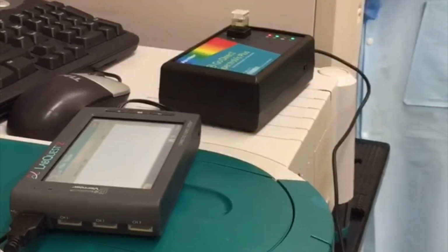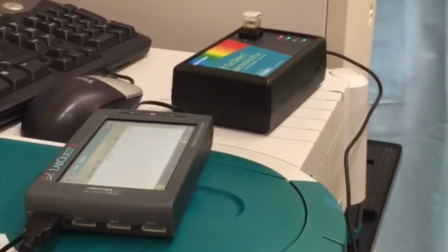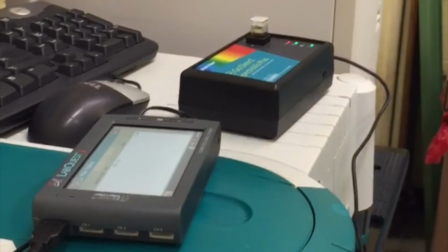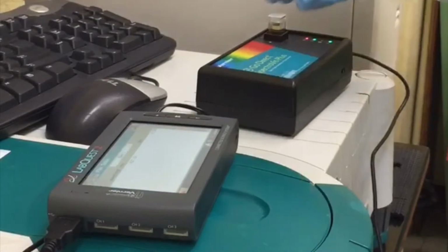Each absorbance was taken at a wavelength of 427 nanometers. The absorbance reading was then recorded, and the sample was placed back into the drug-release solution to maintain constant volume.